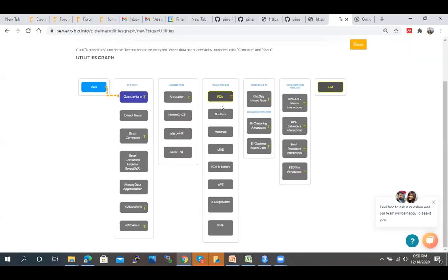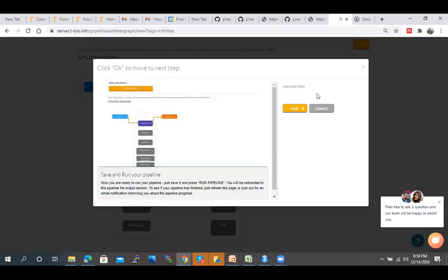The next option is asking whether you want to perform PCA. Here we are skipping this step today, as we are not interested right now in data visualization. If we want to perform data visualization, we can select that, but right now I'm skipping that. Here our aim is to perform only log scale transformation and quantile normalization. Then we complete this pipeline.